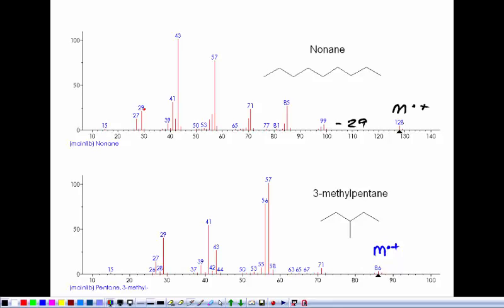So when I broke the bond, I formed both. And then what's left over? Well, 99 is left over. So I took an ethyl group and I cut the bond right there to give me an ethyl radical and then the carbocation on the remaining 7 carbons. So I have a primary carbocation on a 7-carbon chain. Well, the 7-carbon chain is 7 times 12, that's 84, plus whatever number of hydrogens that is, gets me to 99. And so we can look at the differences in the masses to figure out what we lost.